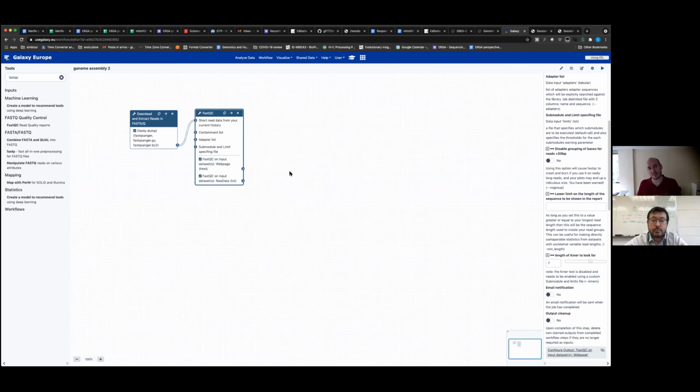Basically, when you upload them, it's smart and it can recognize what kind of files you're dealing with most of the time. So then you can use it throughout the pipeline. Here, of course, with FastQC, we have the possibility. Then I would like you to share your FastQC results. But basically, you have a series of metrics representing the quality of your raw data. Okay, so we're going to look into that in a moment. But let's move on to the next step.